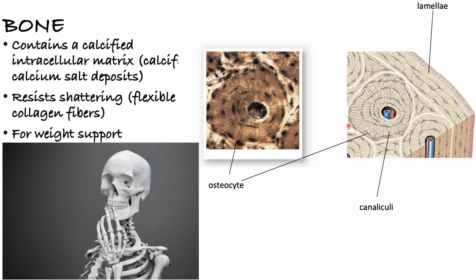I forgot to mention that cartilage cells are called chondrocytes. All right, cartilage cells are called chondrocytes, just like adipose cells are called adipocytes. But when you see this round tree ring pattern, this should tell you that you're looking at bone. No one should see this and say, wait, is this blood? No, or is this fat, or is this dense regular connective tissue, or reticular?